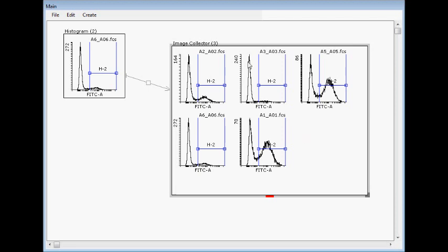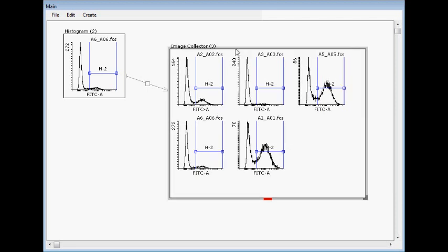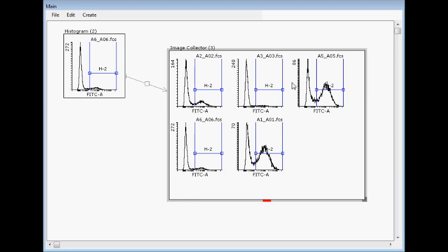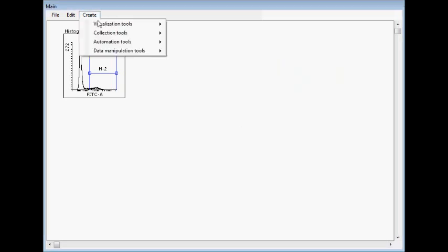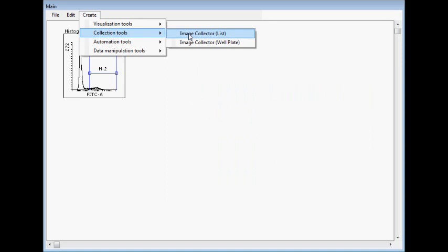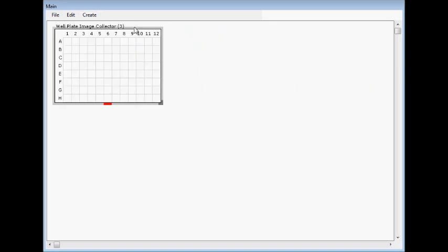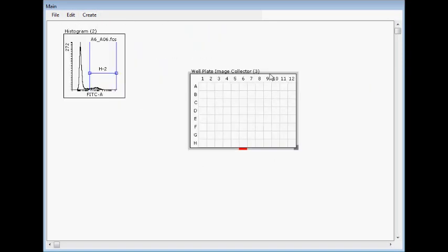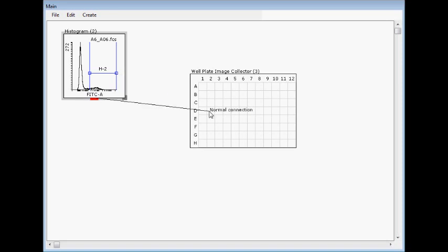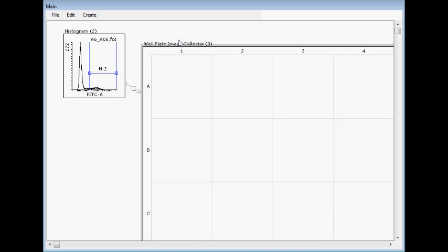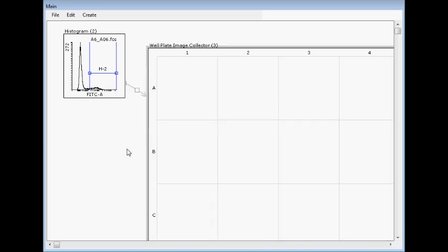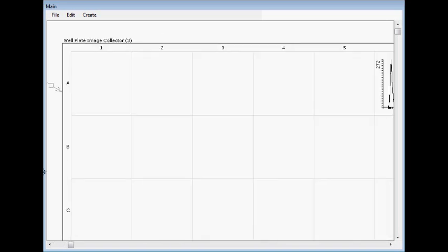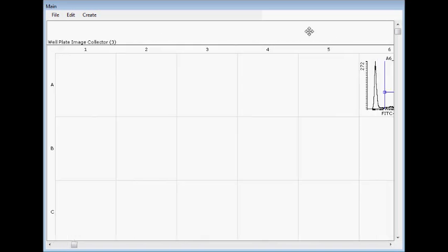If we need the well plate, then let's delete this image collector and create well plate image collector. Now we have well plate format and when connecting this, then it goes automatically into the correct place.